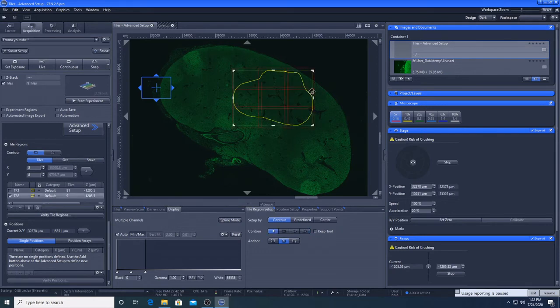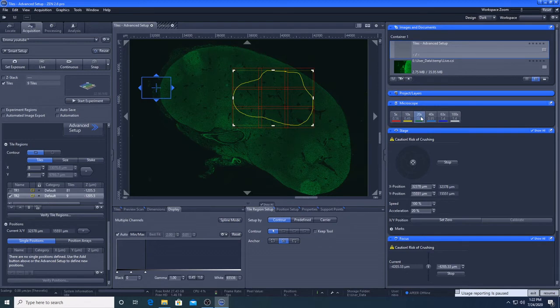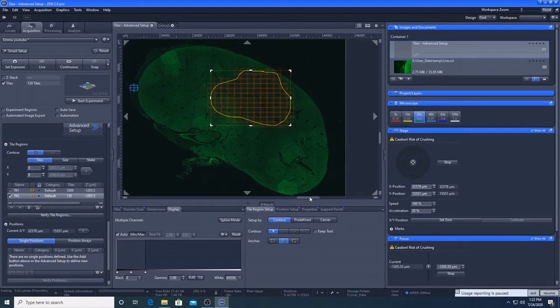So I am just going to define this area here. And then a right click. So this, with the 5x, would only take 9 tiles. But I want to take a more detailed image of this, so I'm going to use the 20x. So you can see how many more tiles there are now.